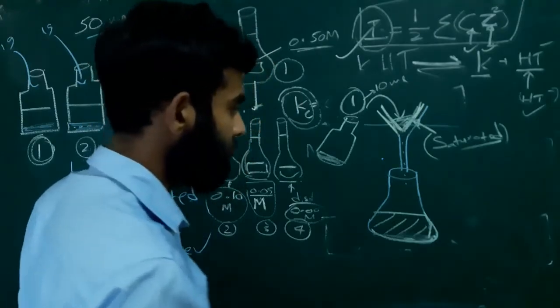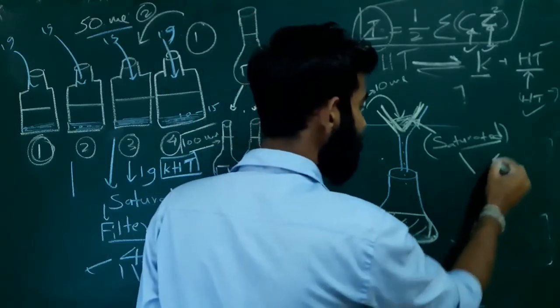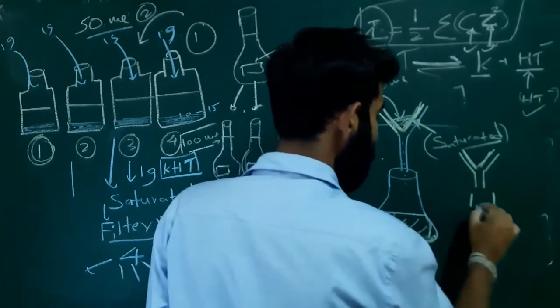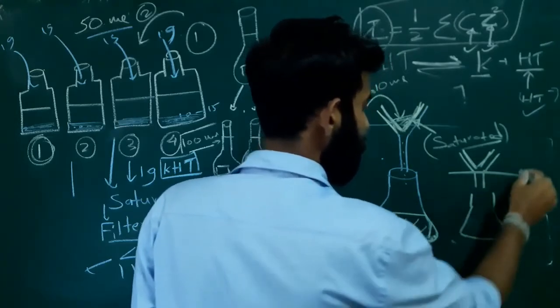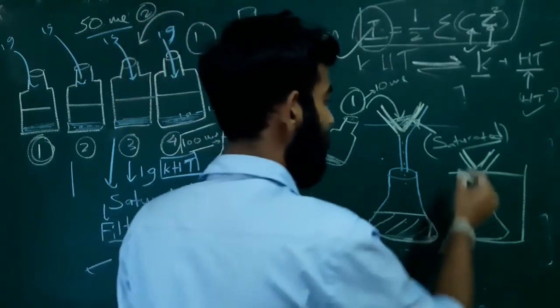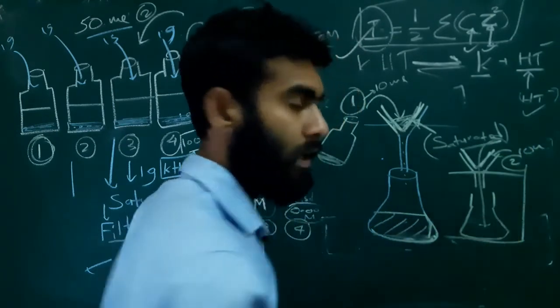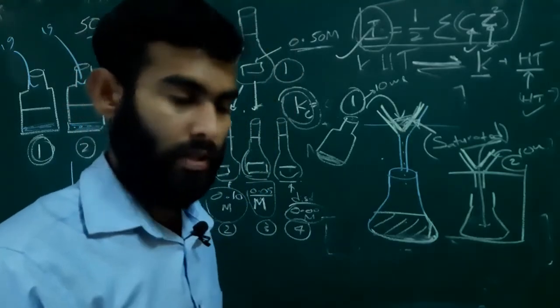Okay, that's the thing. Likewise, we have to use a different filter paper for the next one. We add a new filter paper, a new conical flask and a new funnel too, and again we will saturate the filter paper first using 10 ml of the second solution, and then we will filter. Likewise, we will get 4 different saturated potassium hydrogen tartrate solutions.